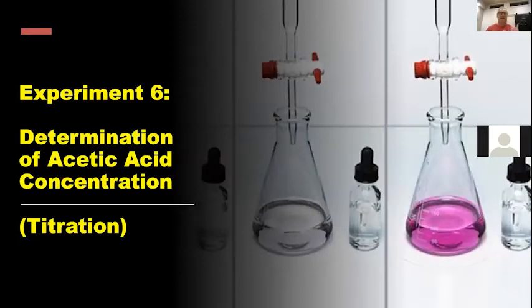So when you take an unknown acid or base of unknown concentration, and then you add a known concentration of an acid or a base to it to determine what the concentration of the unknown is, we call that a titration. And we can monitor this reaction by seeing the change in pH.